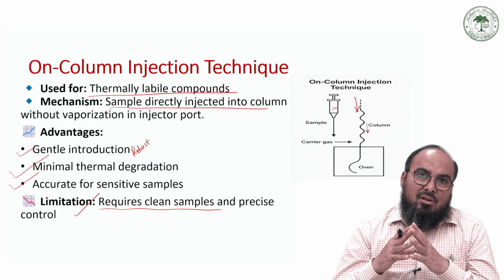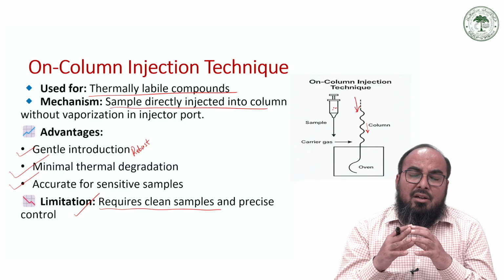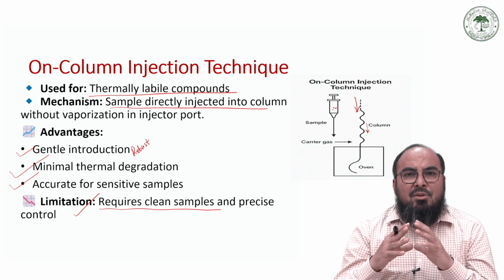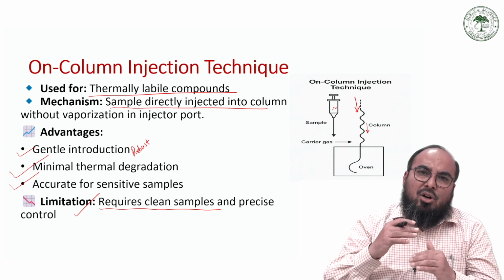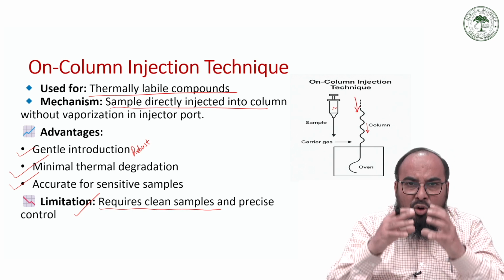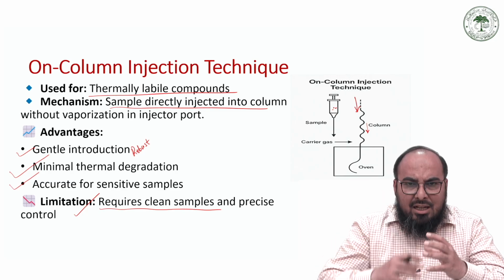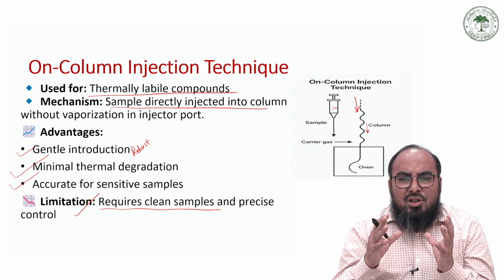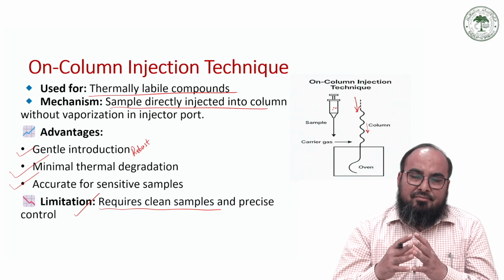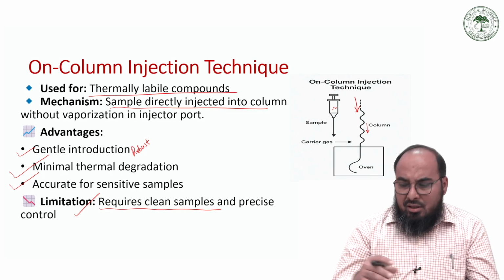And as we discussed in the previous slide, the conformity between the 6 components which we described is very important. Each component should work harmoniously with the other components, so that your full system is harmonized to achieve the best separation. Okay, so you have to keep this in mind.